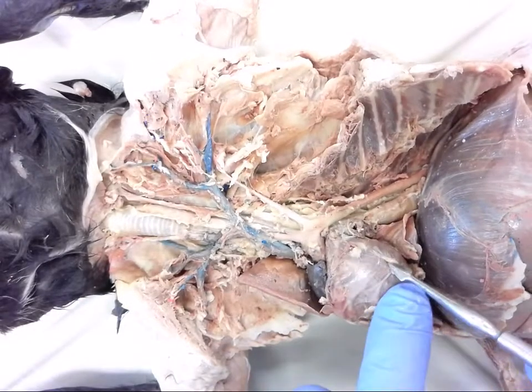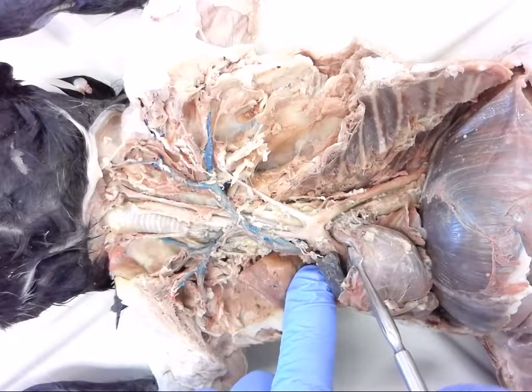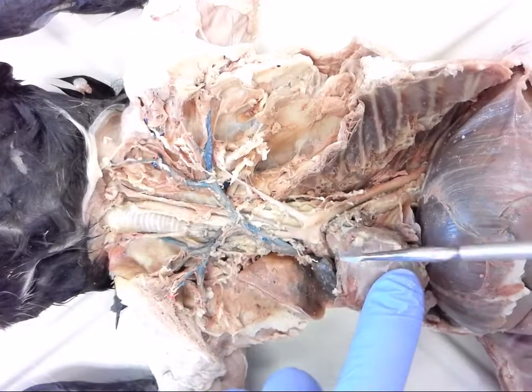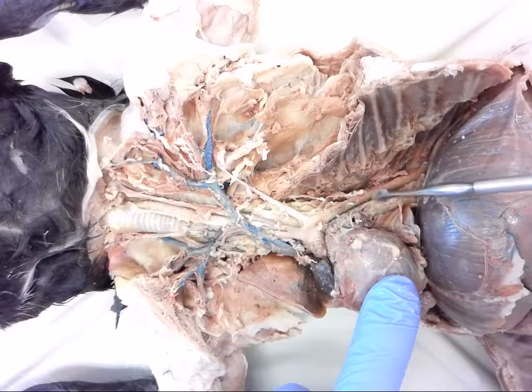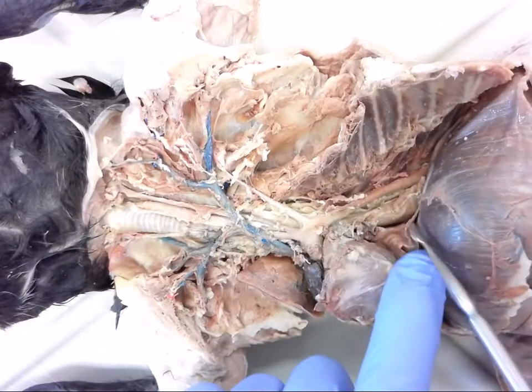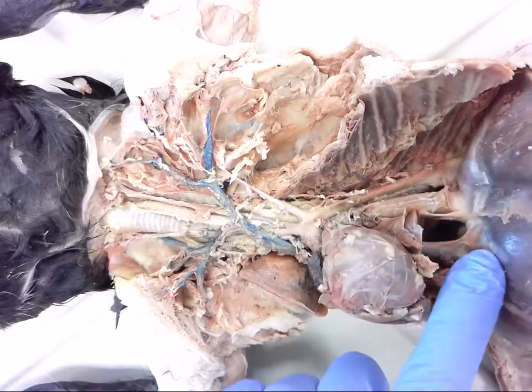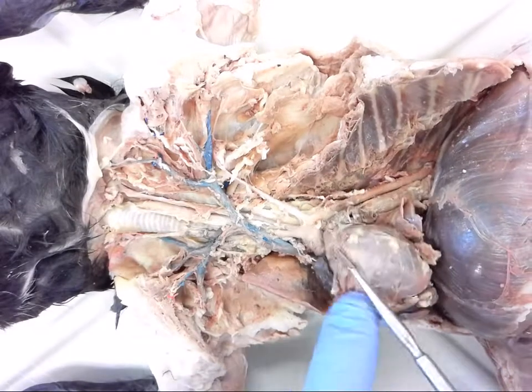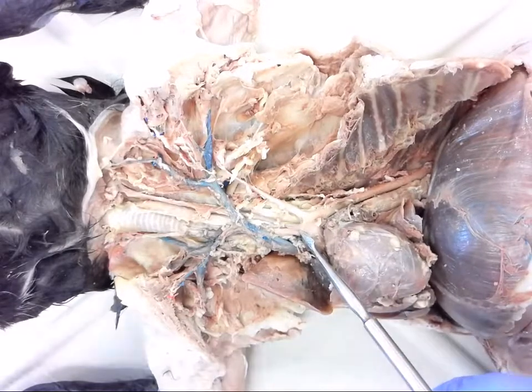And what we have here is the aorta. You have a small bit of it that actually goes up. It's called the ascending aorta, and it is going to arch over. So here's your aortic arch before it comes down to the descending aorta. And what you'll find is this runs along the esophagus, which is right here, really close to the spine. You'll see it goes all the way down until it goes through the diaphragm.